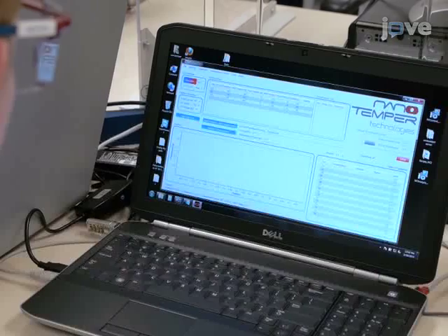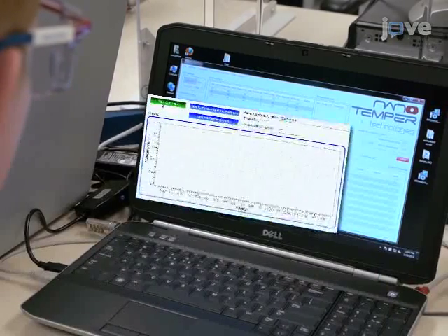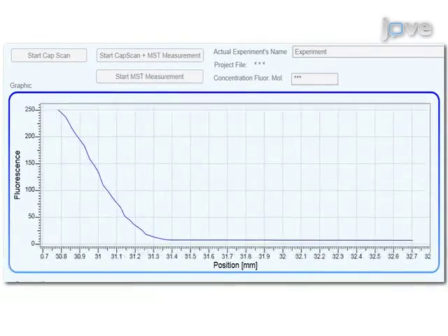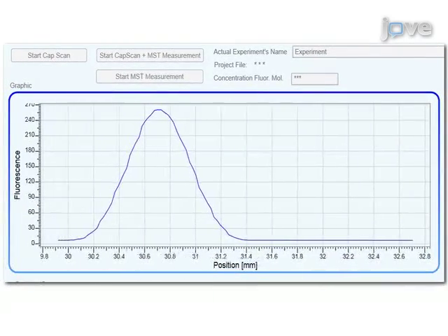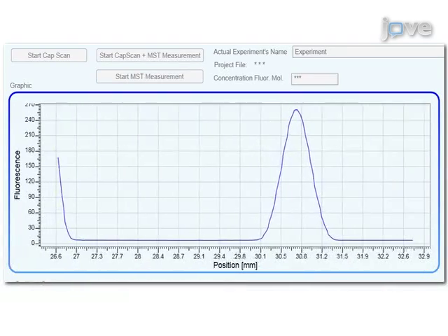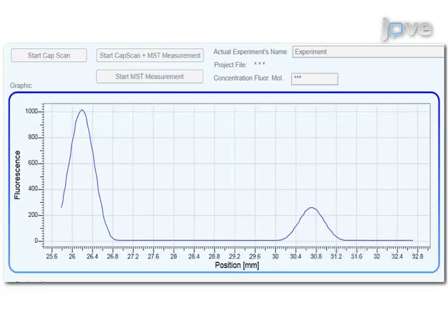Perform the Find Capillaries operation on the control software of the MST instrument. The optimal fluorescence range in diluted lysate is from 400 to 1500 fluorescence units. Proceed to determine the optimal ligand concentration range as described in the text protocol.